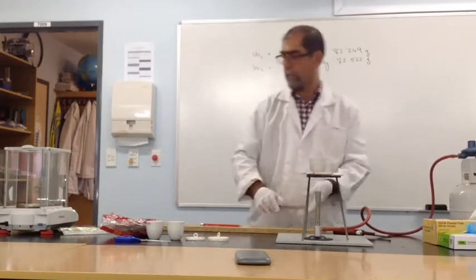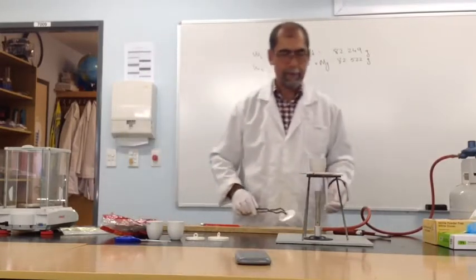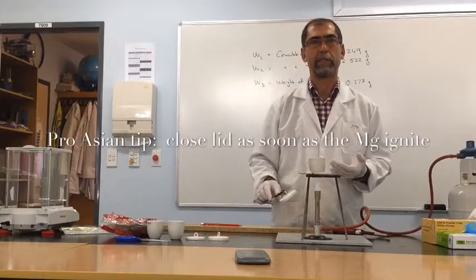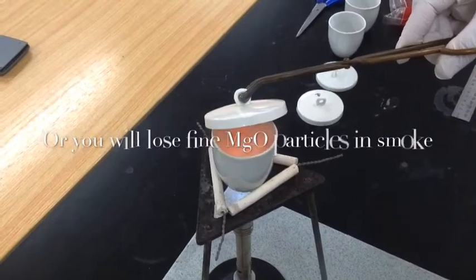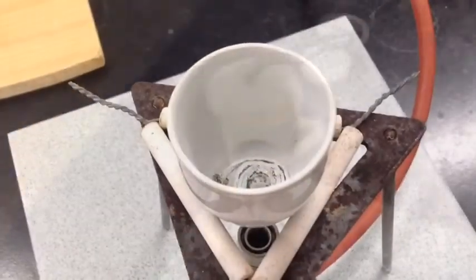That's better. And keep watching it so that as soon as you see a sign of sparkle, you close it. That's losing. So that's how the product looks.